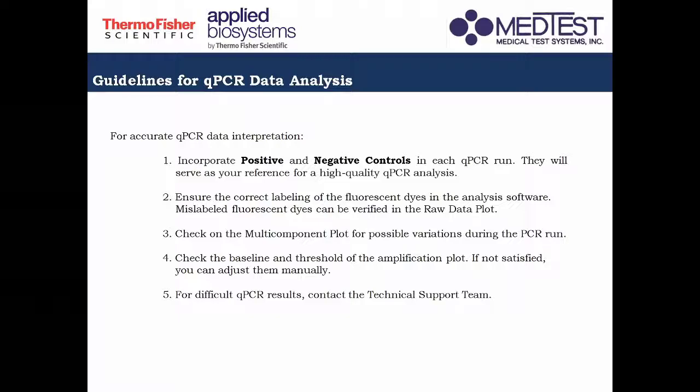But don't fret because we can reanalyze the qPCR result naman. We have the design and analysis software which I will be training you by next week.